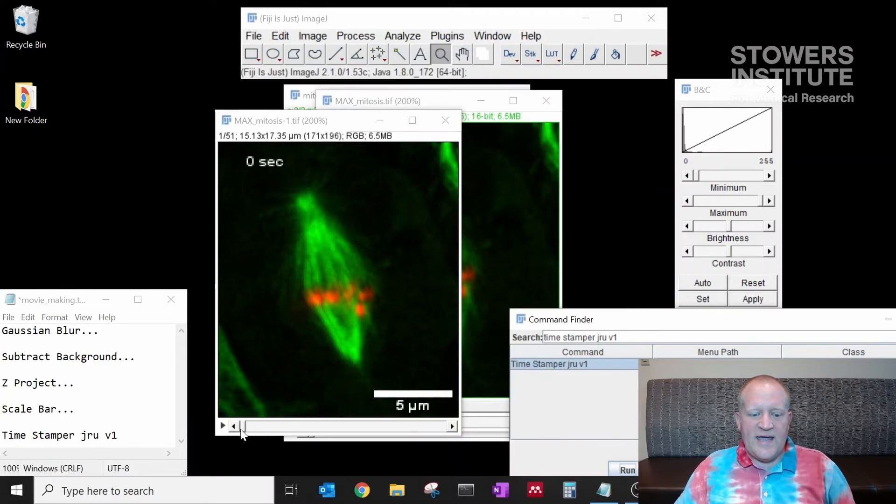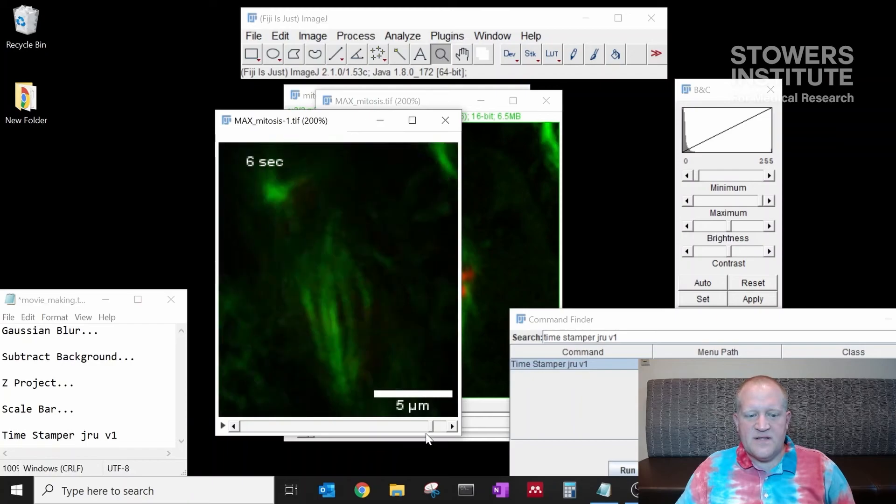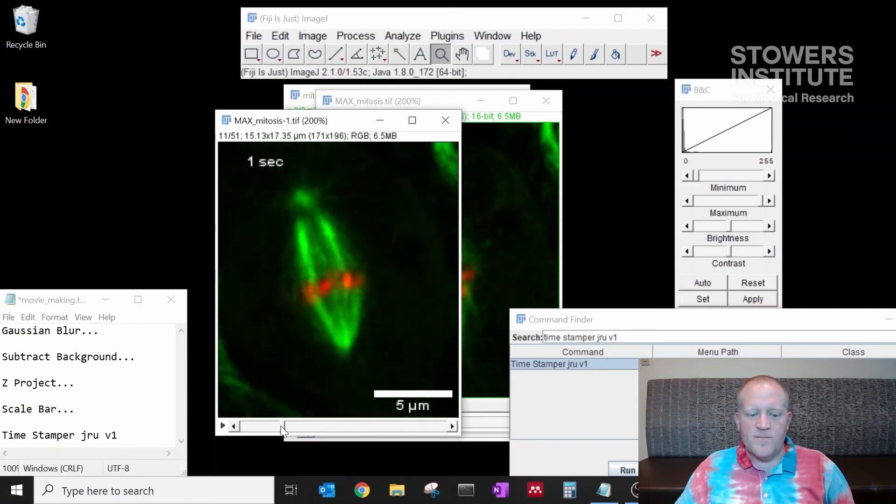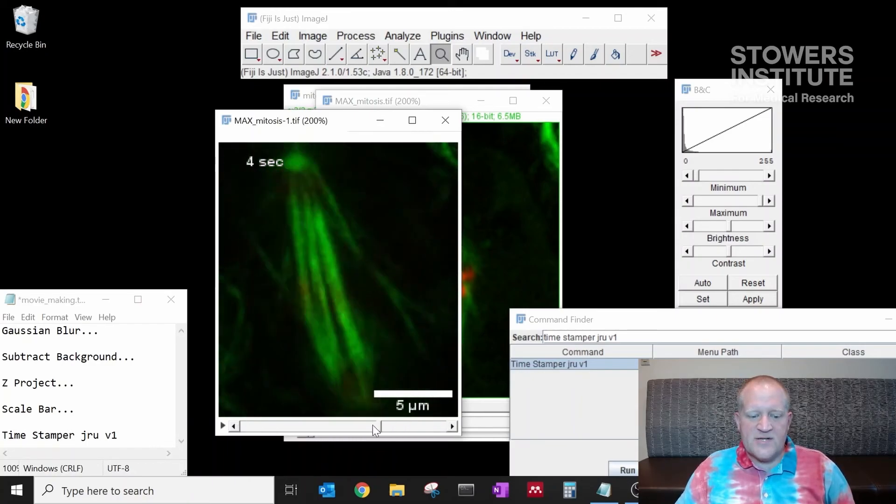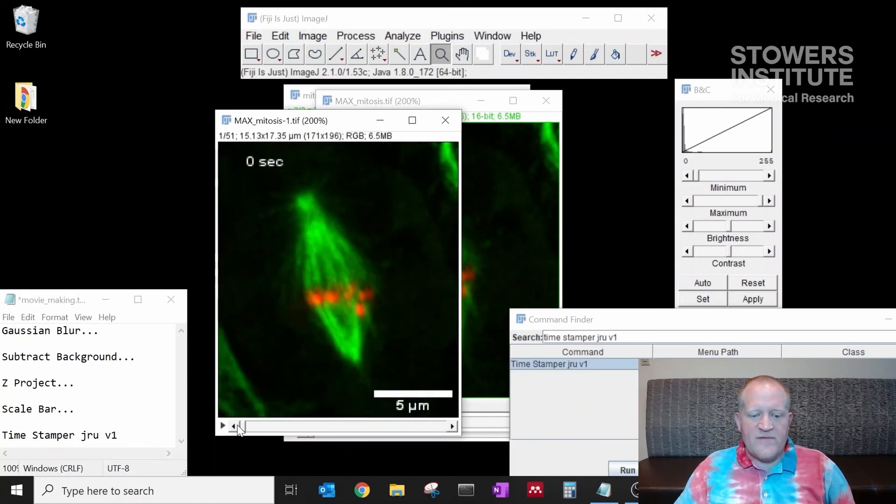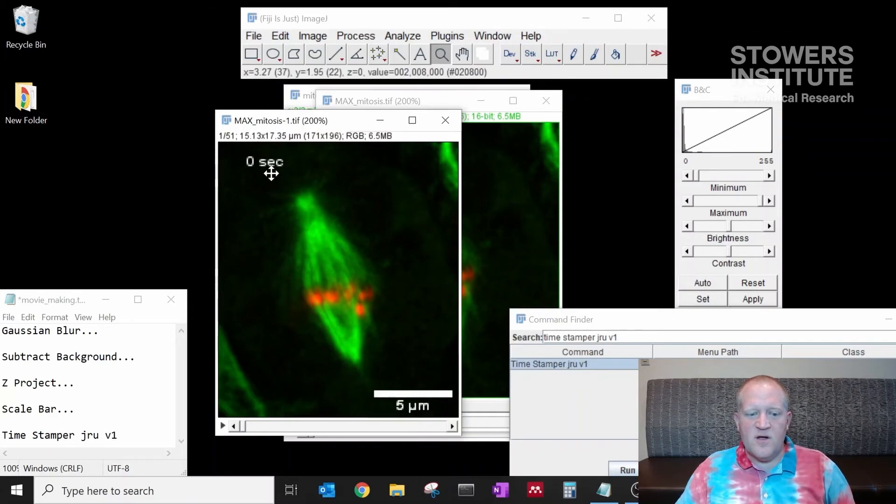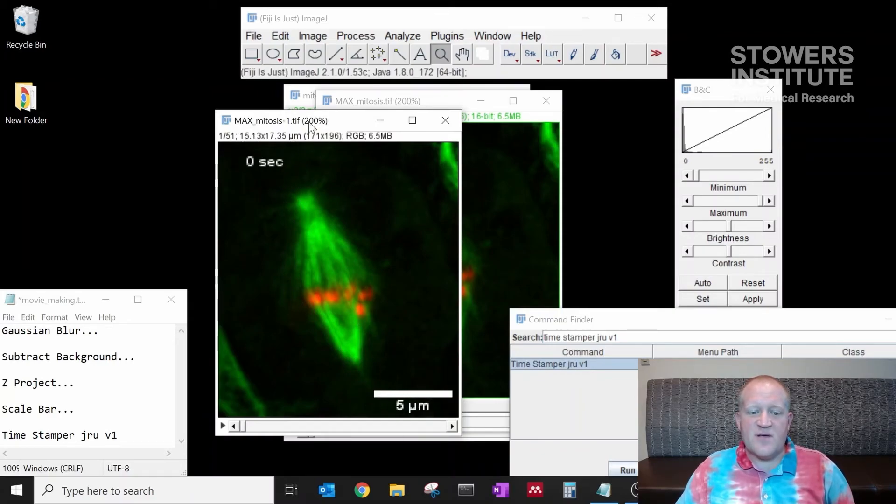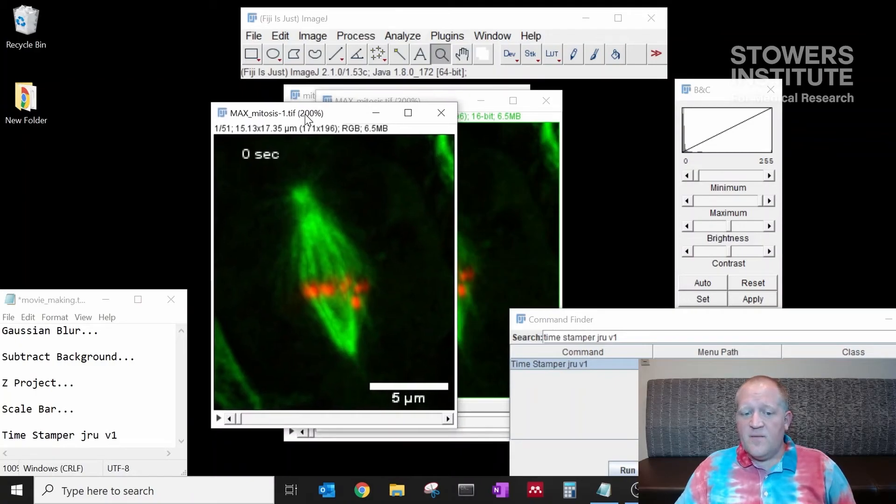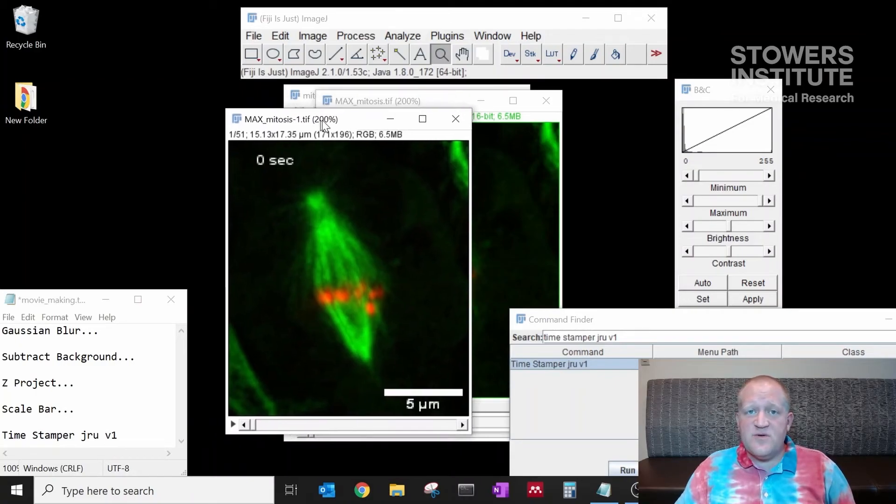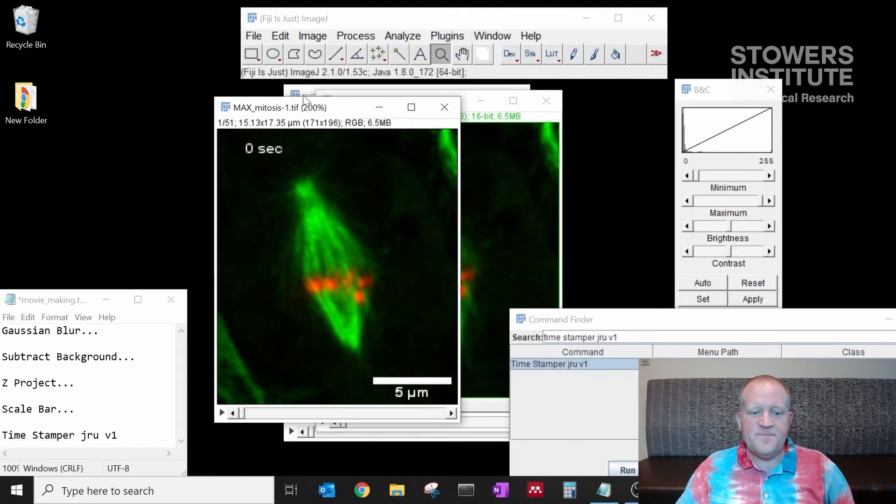Now I'll click OK. And you can see that our data now has the timestamp in the top left corner over the movie. So now we have an intact data set that has our scale bar, our timestamp, and we want to save this as a movie. I recommend saving as a TIFF before you save as a movie so that you have this that you can go back to and modify later if you need to add things.